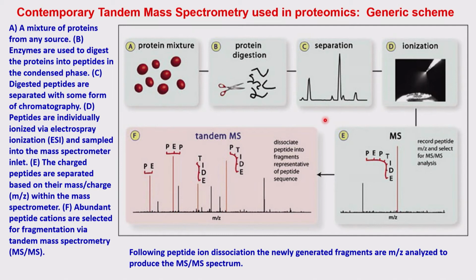You can initially identify the proteins, then you look for some specific sequence and then do further mass, that is called tandem mass. You can use a little greater ionization so that you can do that and then look at this. Then go into the literature, a lot of data is available online and you can try to map them. Mapping, I will explain a little bit better in the next couple of slides. I hope you understand this.